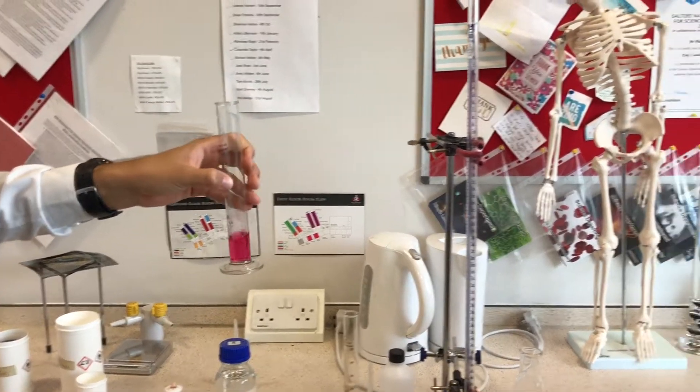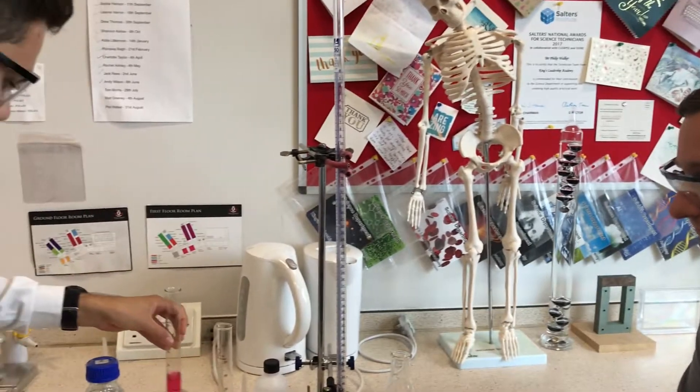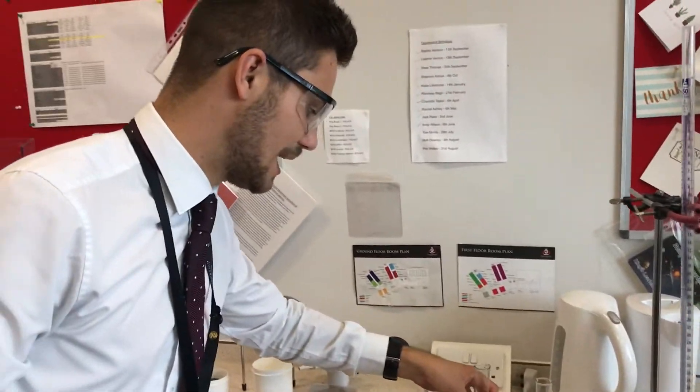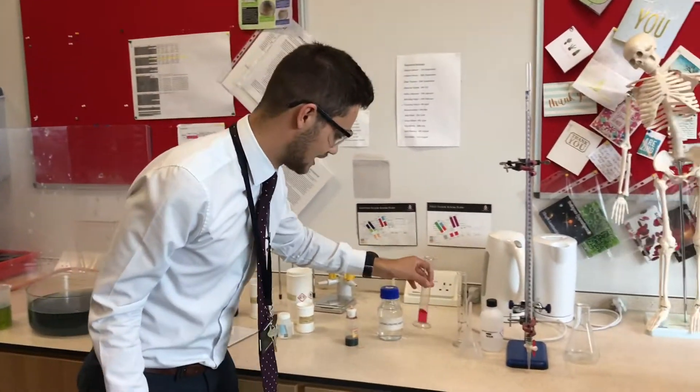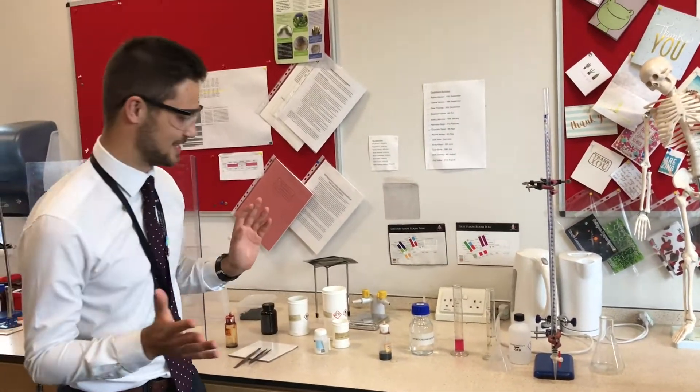So that means it's quite a strong acid. If it was more of an orange or yellow colour, it would be a much weaker acid. However, there are lots of H+ ions in there — very strong acid. Careful not to spill it on myself.